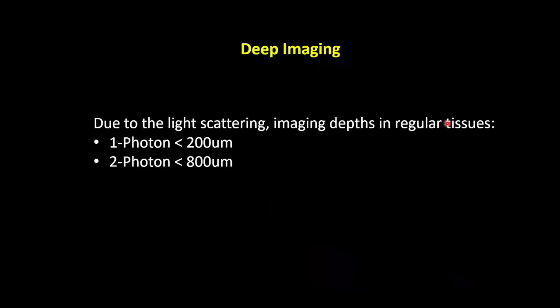And deep imaging. Due to light scattering, the imaging depth in regular tissues for one photon, for example confocal, usually cannot go beyond 200 micrometers, and for two-photon or multi-photon it is usually limited to about 1 millimeter, or about 800 micrometers.